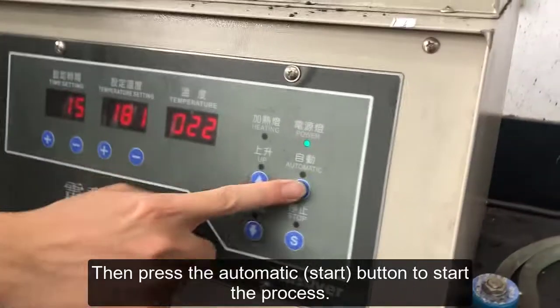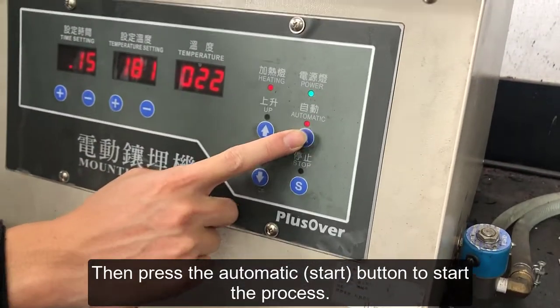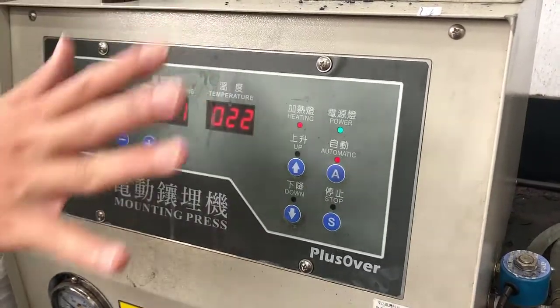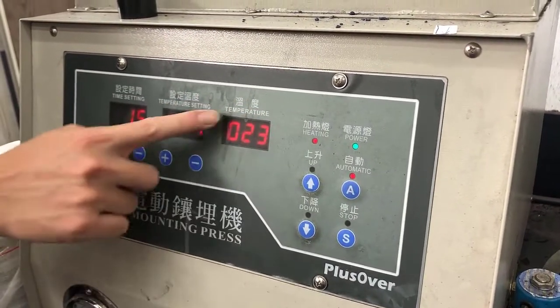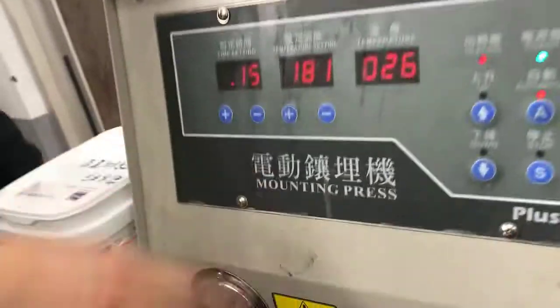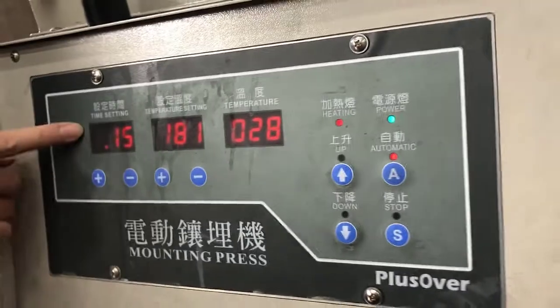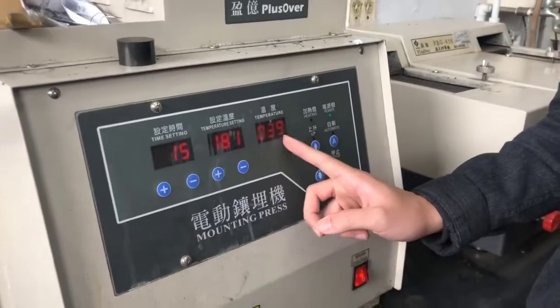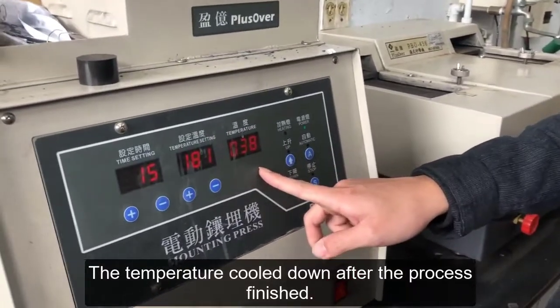Then press the automatic button to start the process. The actual temperature will begin increasing during the process.